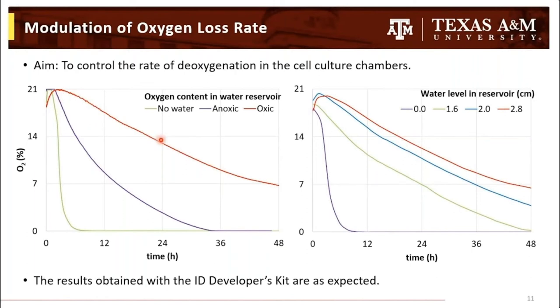And finally, the second approach that we used was the modulation of the water level that's covering the device. Once again, if the chips are not covered in any water, you see a very sharp drop in the oxygen concentration in the system.